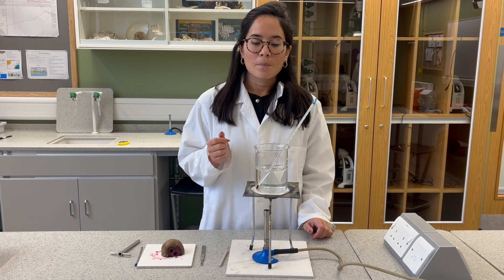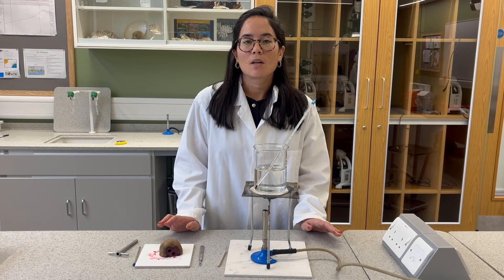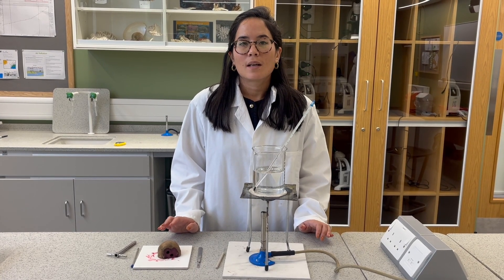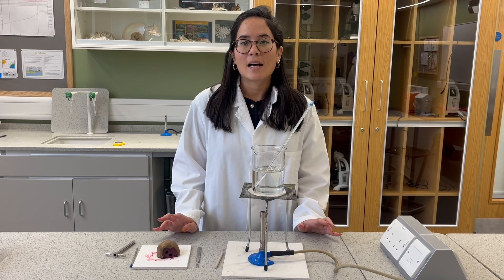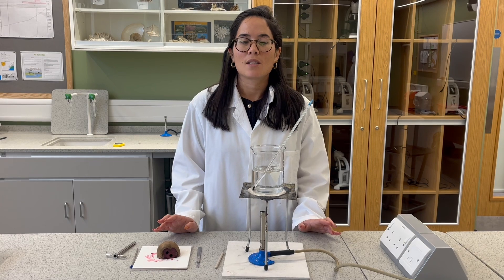...60 degrees Celsius. After leaving them in distilled water for half an hour, we're going to run that water through a colorimeter, and that will tell us effectively how much of the stain has left the beetroot and how much that membrane has broken down.